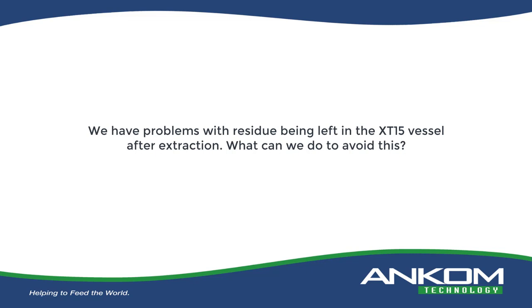From time to time, I'll see a little bit of, if you will, a little bit of blackening in the bottom of the Teflon cup after I've extracted hydrolysis samples, simply because the samples themselves have been blackened as a result of the acid in the hydrolysis, and then of course going through the drying process. I don't see that as very much, and it doesn't seem to affect the results certainly from a weight point of view, because there is very little. Oh yes, okay, the blackening of the cup. Yeah, you may see just a little bit of that in the bottom of the cup, but again, it should be negligible as far as any actual weight loss is concerned.